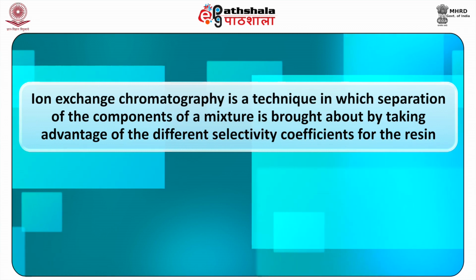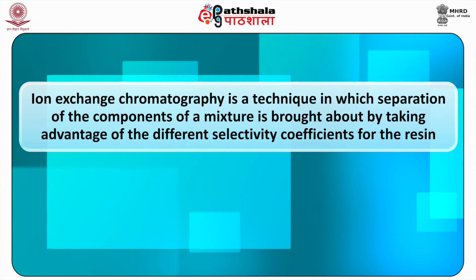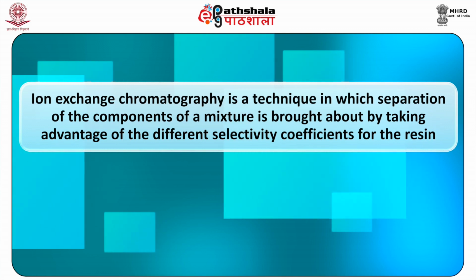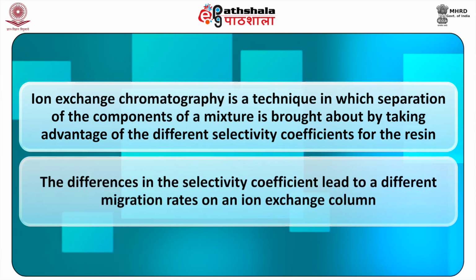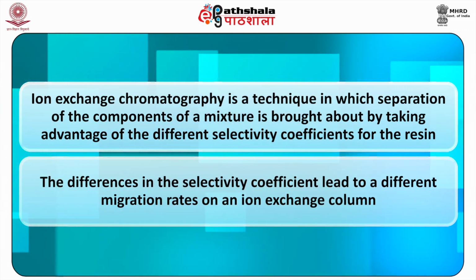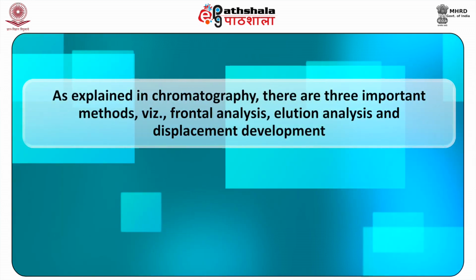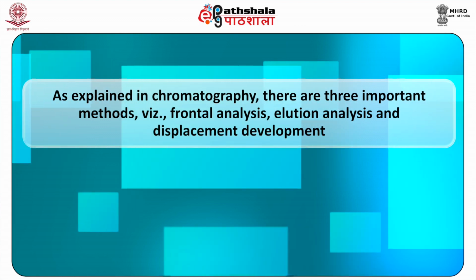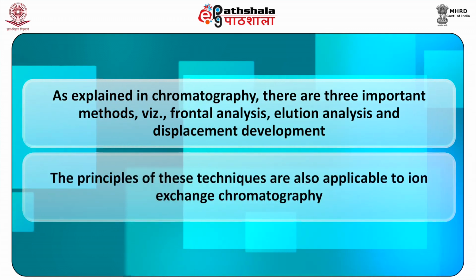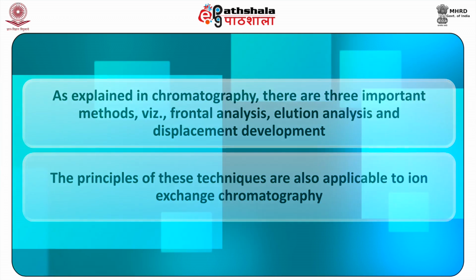Essentially, ion exchange chromatography is a technique in which the separation of the components of a mixture is brought about by taking advantage of the different selectivity coefficients for the resin. The differences in the selectivity coefficient lead to different migration rates on an ion exchange column. As explained in chromatography, there are three important methods, that is frontal analysis, elution analysis and displacement development. The principles of these techniques are also applicable to ion exchange chromatography.